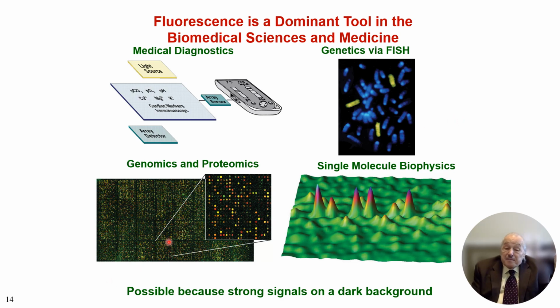A remarkable development has been the development of DNA arrays, where it's possible to put all of the 32,000 human genes on a single slide, spot them on the slide, and by other multiple spotting methods, detect something about each of those genes.